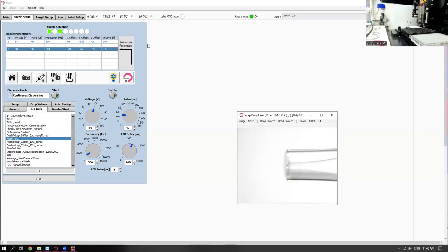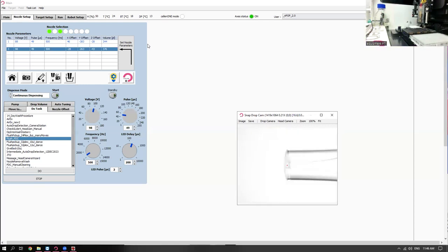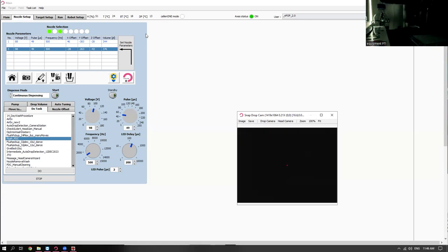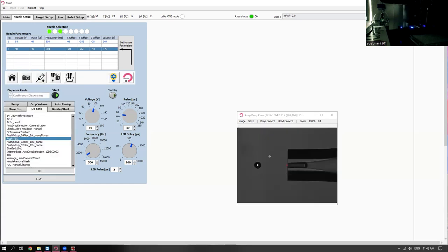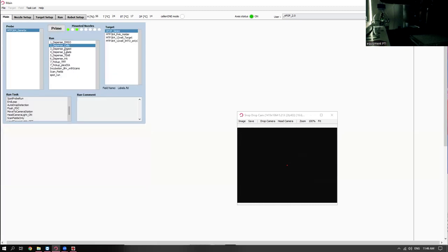We got it in G1, 2, and 3. That's right. So we'll close the door up here. We can do all of our imaging. We get a very nice drop. So we go and select our labels. We just imagine that we already dispensed the trypsin and we all went to sleep. We came back in the morning.